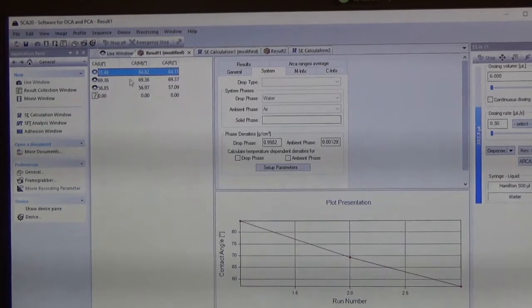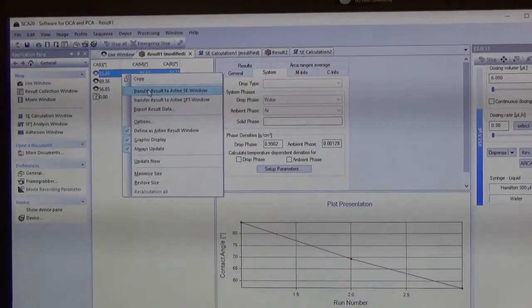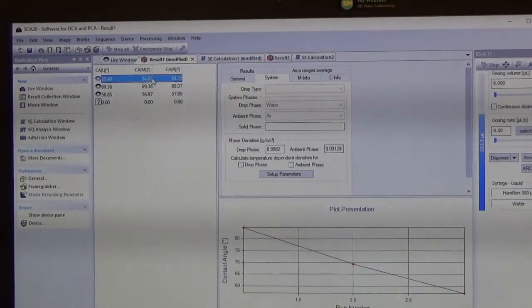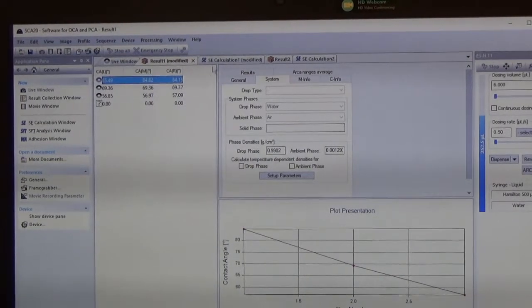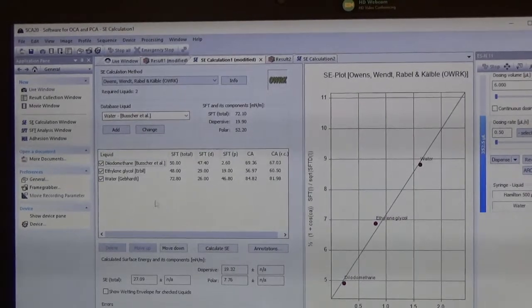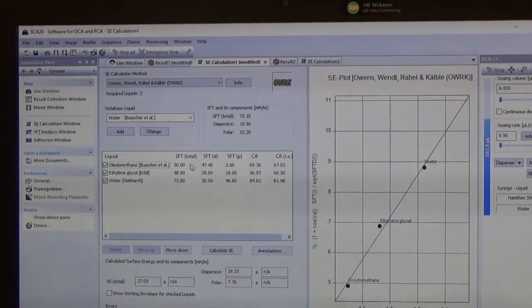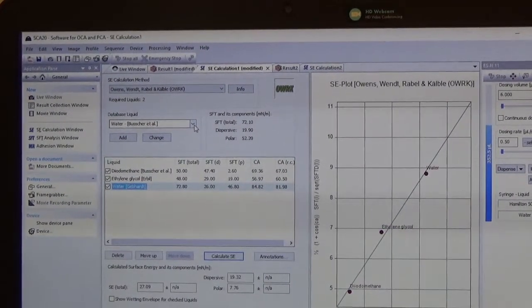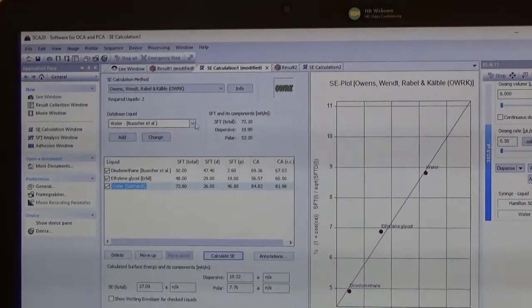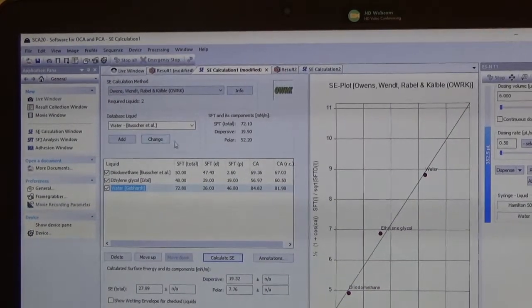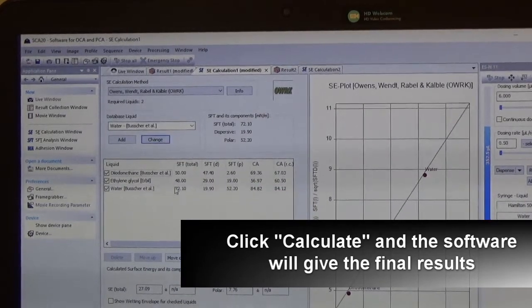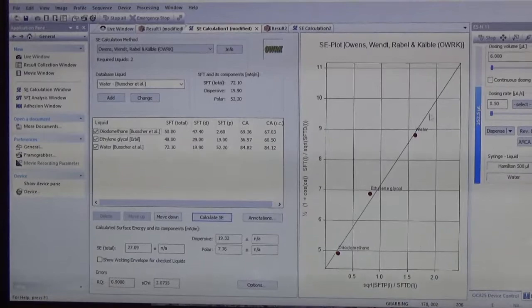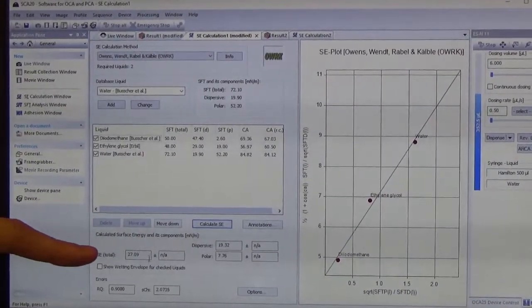Next, open the surface free energy calculation window. Go back to the result tab, right-click, and transfer the results to the surface free energy calculation window. The three results for the three different solutions will appear. You can change the liquid type within the database — for example, water using the Owens-Wendt method. Press the calculate button and the surface free energy value and graph will be displayed.